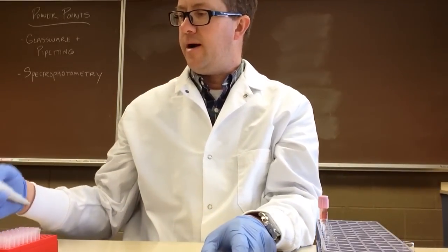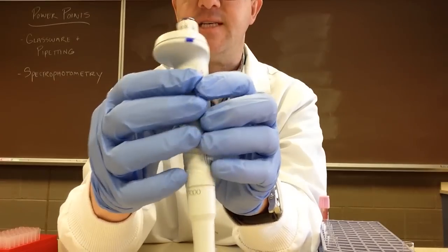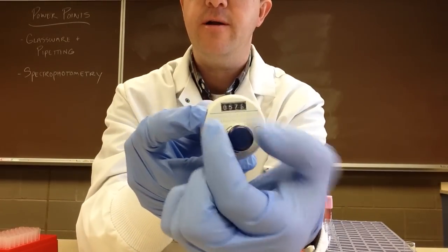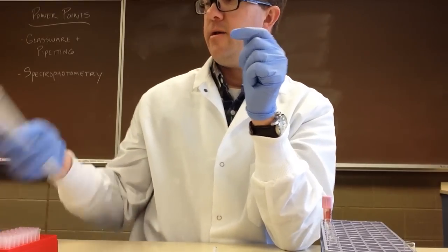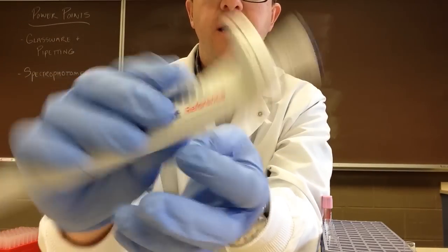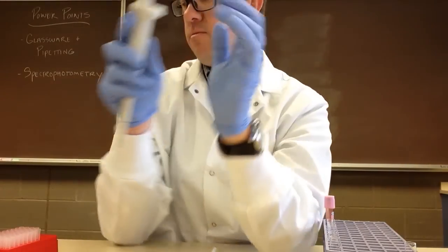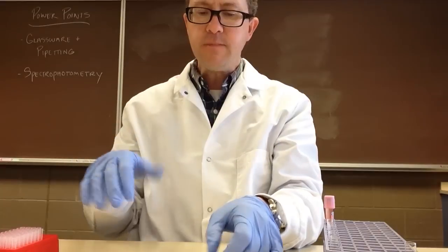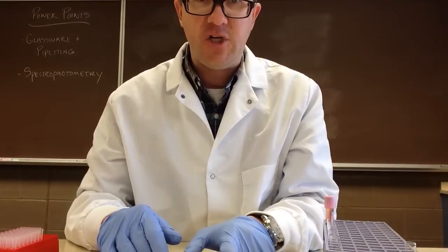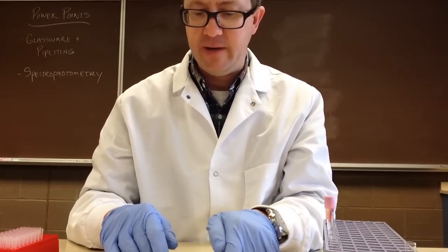With our larger one, this has a little different system. You have to push this button on the side and then you can turn and adjust it to what you want. And then we have another one that's just a fixed volume — it's just 1,000, with no meter or buttons. So whenever you're adjusting your micropipetters, make sure you do it very gently and certainly don't force anything that doesn't seem to be moving.